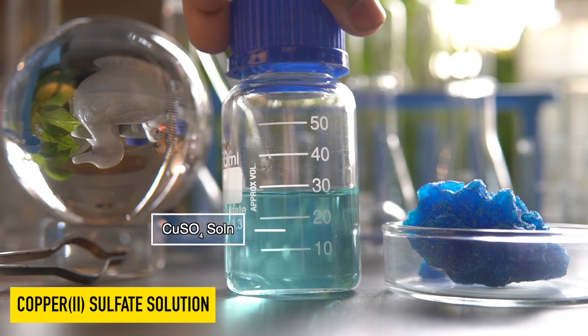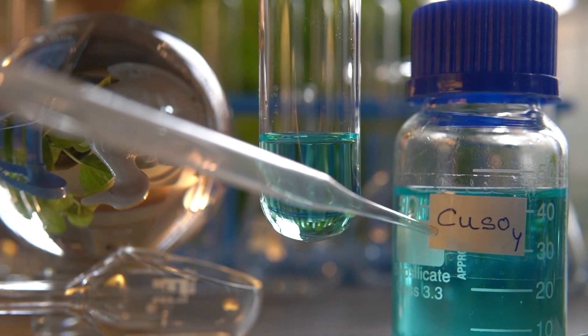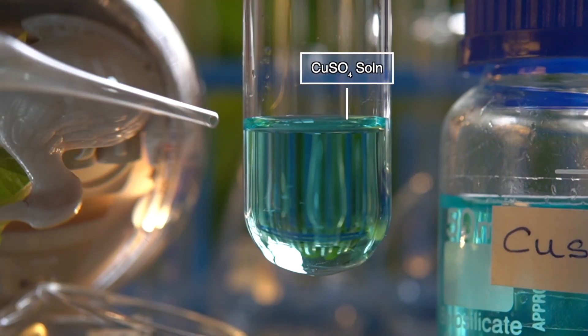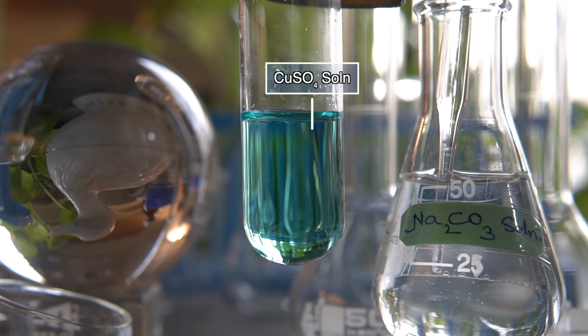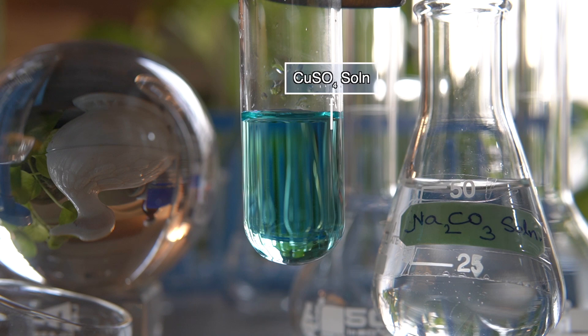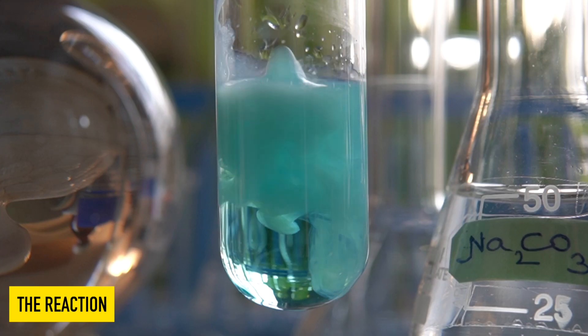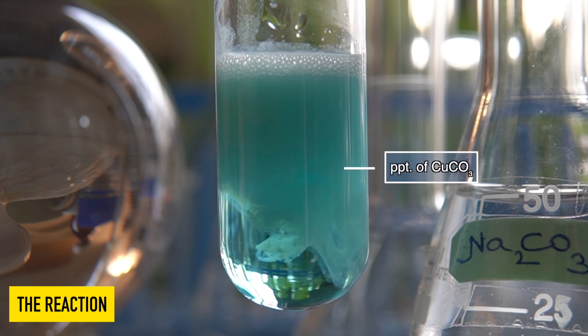Now to initiate the chemical reaction, we will take some clear solution of copper sulfate into this test tube. We will add the aqueous solution of sodium carbonate drop-wise onto copper sulfate solution slowly and observe the effects.